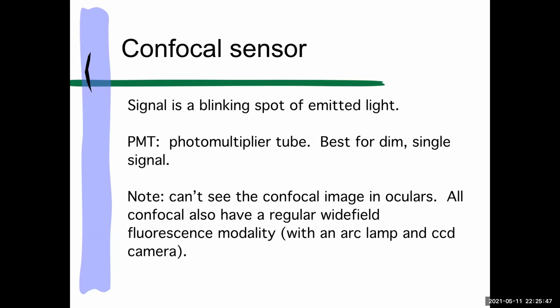Sometimes we do that on purpose. I've seen things bubble up, and I've seen stuff get cooked literally on a confocal if you look at stuff too long. Remember, lasers are also used in surgery and things like that, right? So there are all these trade-offs between the laser power and the fact that you want to be gentle with your specimens, especially if live.